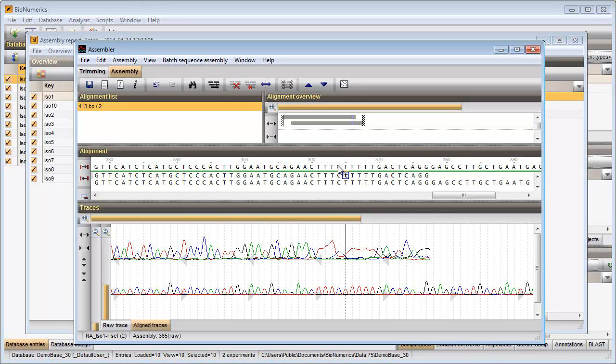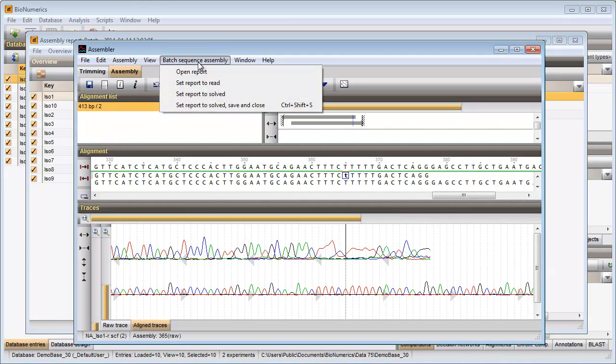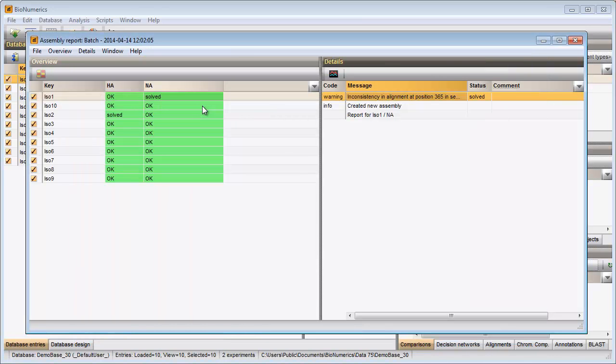I save the changes to the database. And the cell is updated and is displayed in green. I will close the overview report window with file exit.